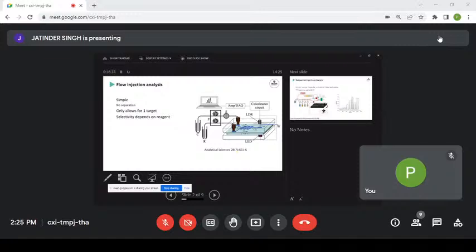A lot cheaper than what Professor Malik talked about this morning with the UV detectors in HPLC. They've got a multi-wavelength light source where you can select a wavelength. Got really advanced data acquisition in there. Really great, but it's a big box. And for a lot of this work, you actually don't need a lot of wavelengths because you know what you're doing, and you only need one.